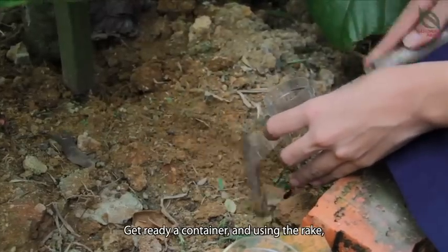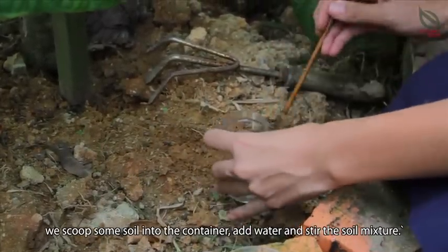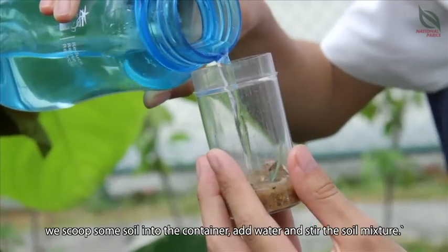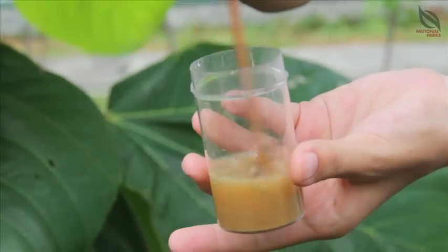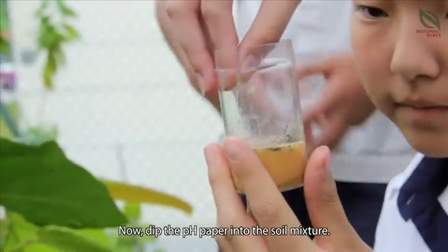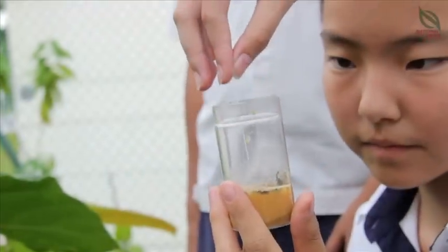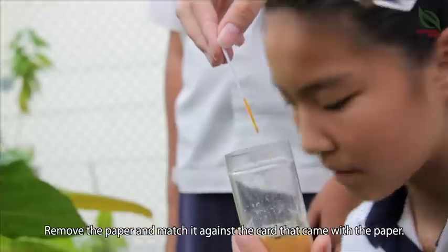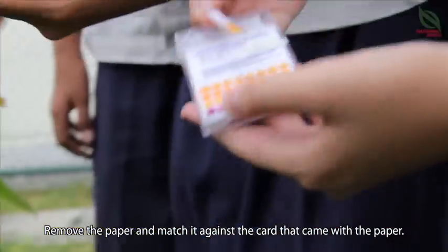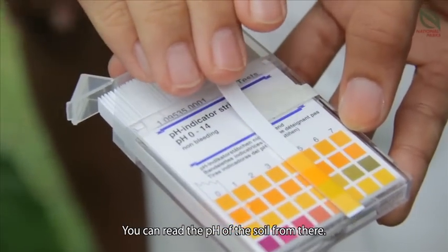Get ready a container and using the rake to scoop some soil into the container, add the water and stir the soil mixture. Then use the pH paper to dip into the soil mixture. Remove the paper and match it against the chart given on the paper, and you can read the pH of the soil from that.